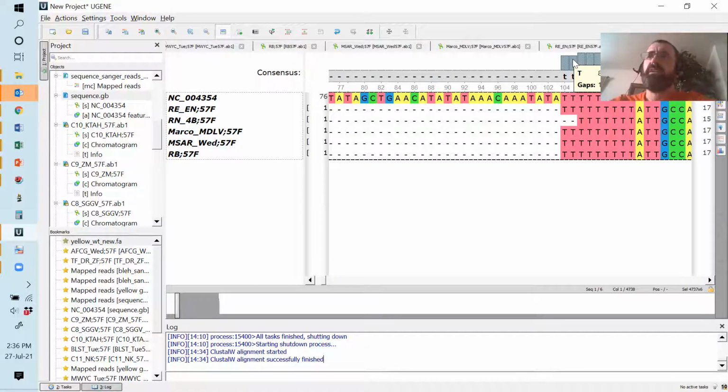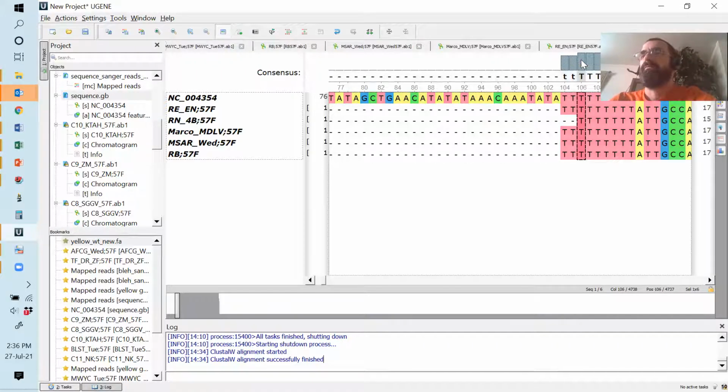Pardon me. So if you have here, for example, 100%, oh, hang on a second, 100% of the bases at that position are T's. If you look here, only 83% are T's. One of them is a gap, and the gap exists because there's a space here for this sequence. It was missing from the sequence read, right? When we chopped it off when we cleaned things up.